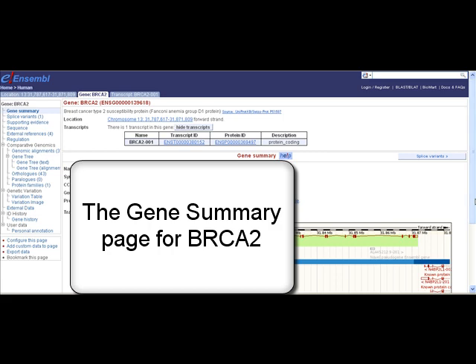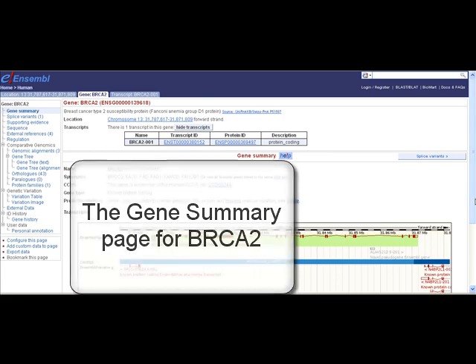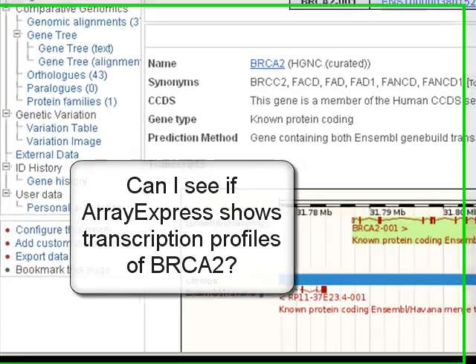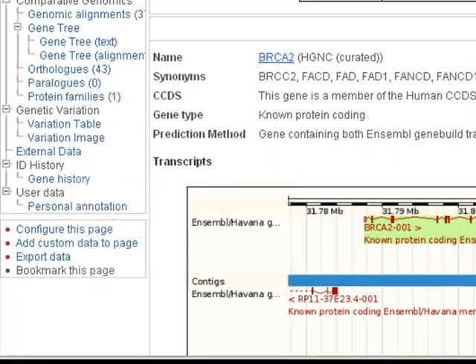Is there information in ArrayExpress for my gene? I'm looking at BRCA2. ArrayExpress is an external source — data not stored in Ensembl.